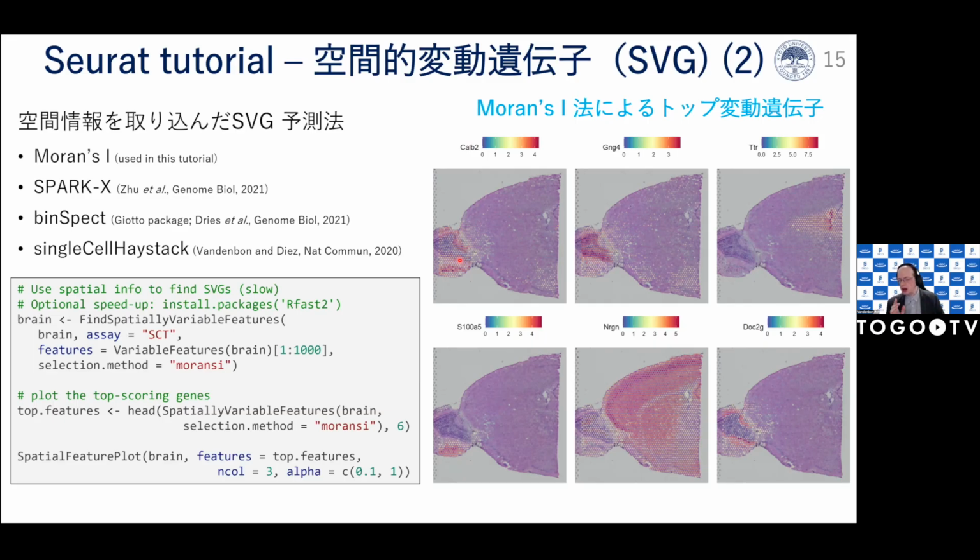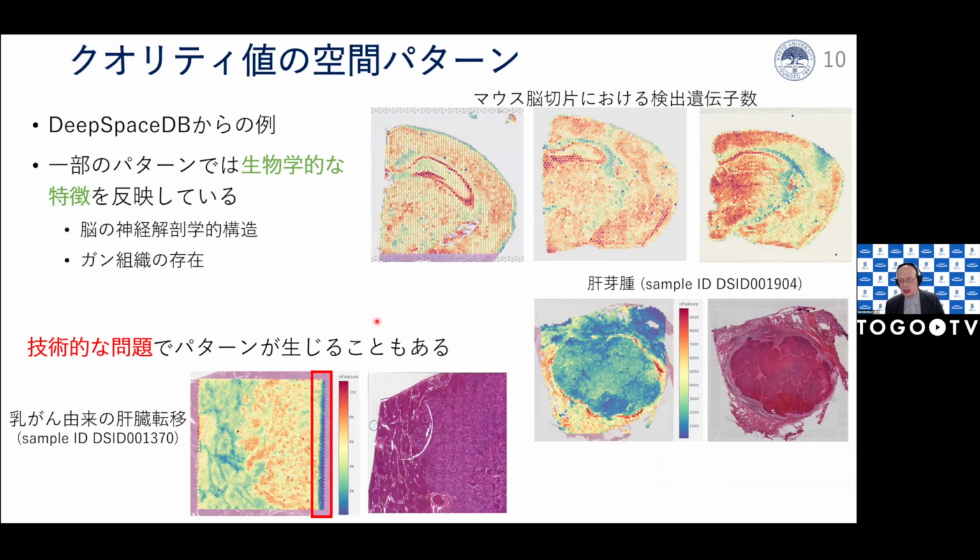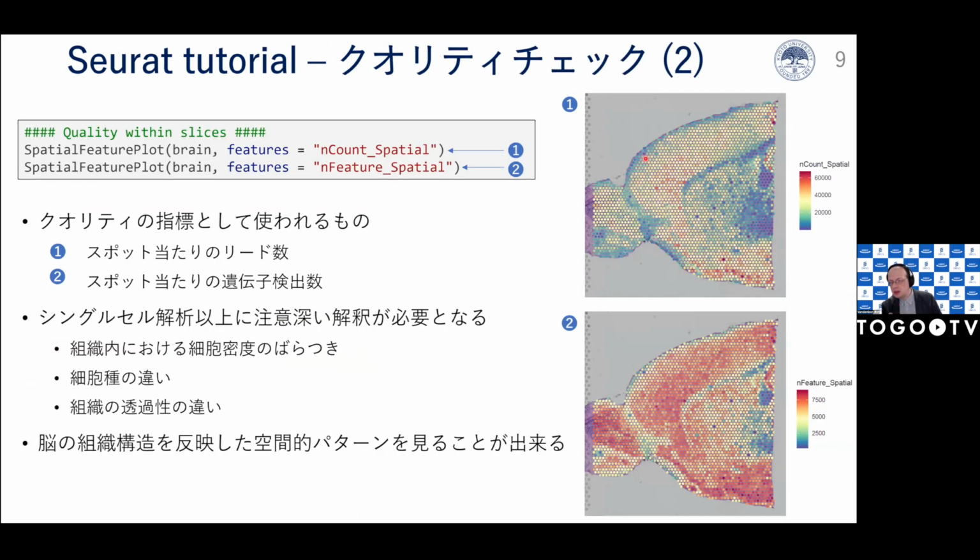And also, this pattern, maybe I should show it on another slide. The pattern used in Visium is a hexagonal pattern, right? The same file also includes the row and the column of every spot. So you can also use that to see the location of every spot.